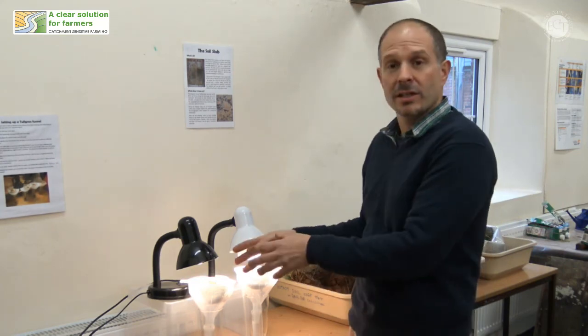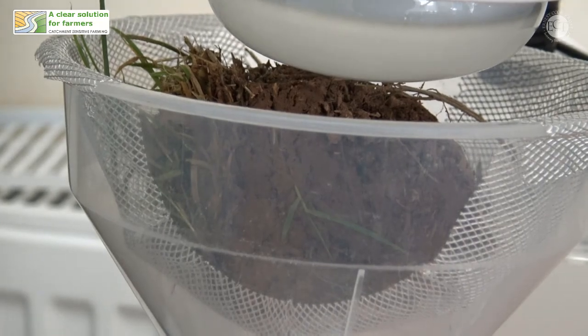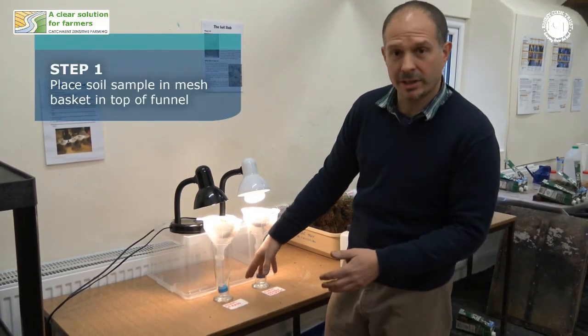Once you've dug out your little chunk of soil, you can then place it in the top of this apparatus, and the creatures will then come out of the soil, they'll go through the mesh, and they'll go down through the funnel and into the collection pot.